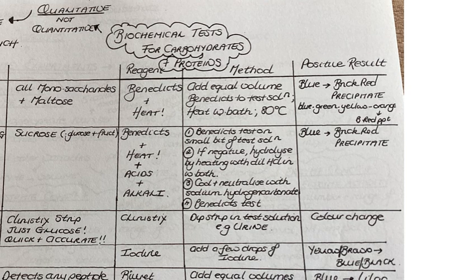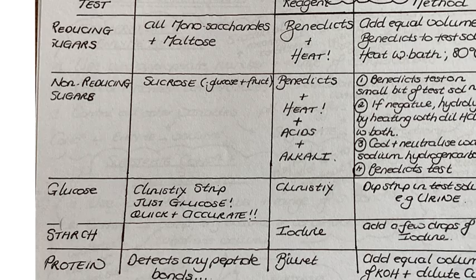So what would a positive test look like? Well, the blue Benedict's will become a brick red precipitate. Again, if you don't use the word precipitate, you will not get the mark. So the Benedict's test is a little bit unusual because although it doesn't tell us the quantity of sugar, it indicates slightly how much sugar is present. So if, for example, the Benedict's changed from blue to green, that would mean a very, very small amount of a reducing sugar was present. If it went from blue to yellow, that would mean there's slightly more reducing sugar present, etc. So that is the Benedict's test.